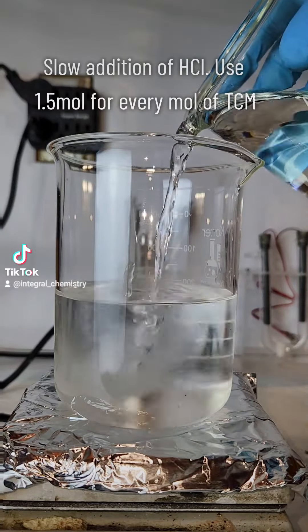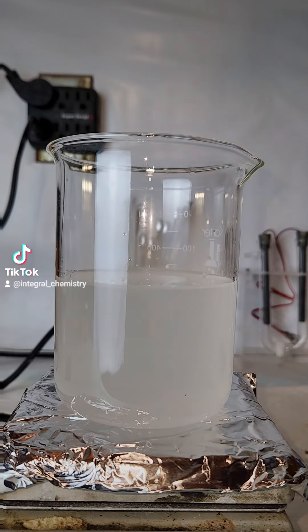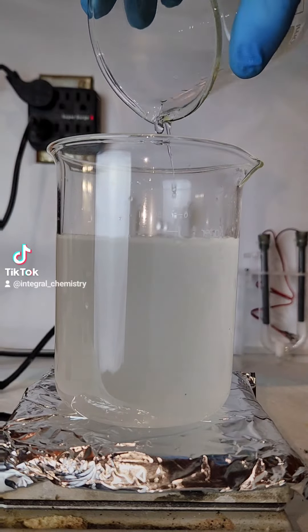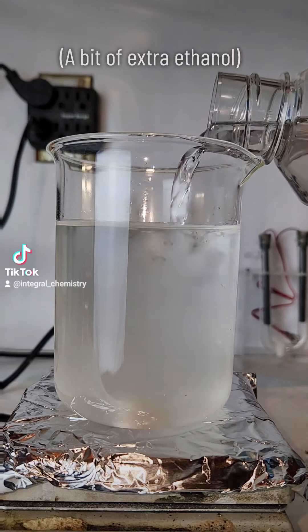Before I go any further, I want to make it clear that this is not an efficient process for synthesizing DCM. If you're looking for DCM, you are better off just buying it, because no at-home process is going to be both safe and efficient.